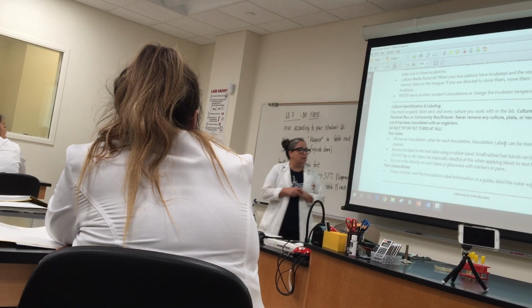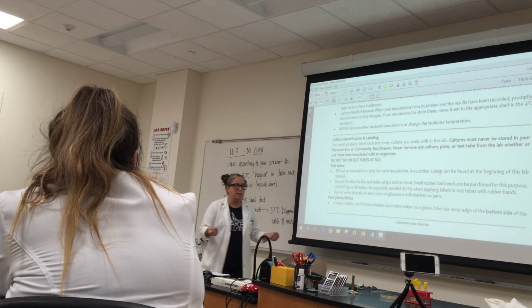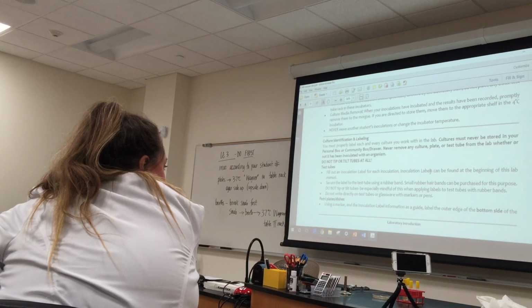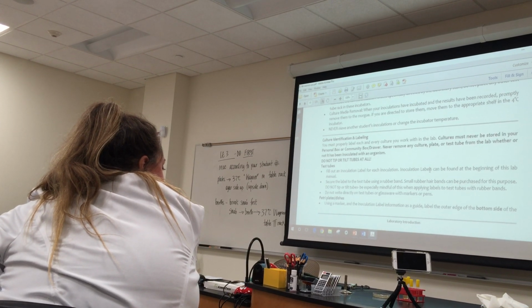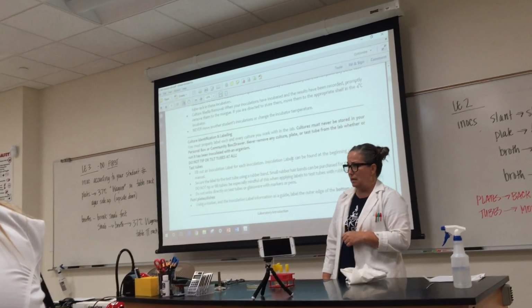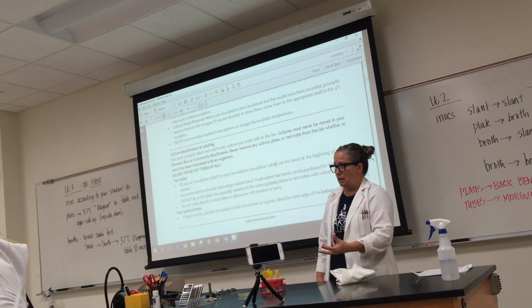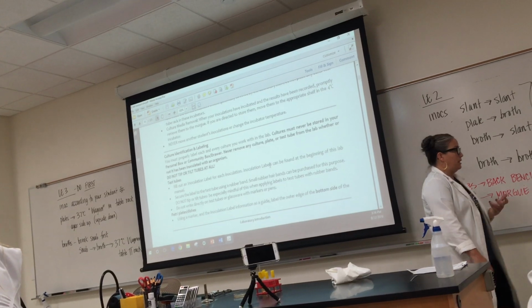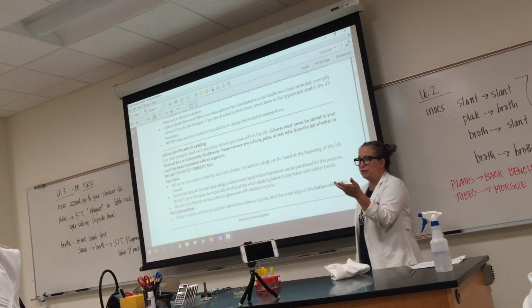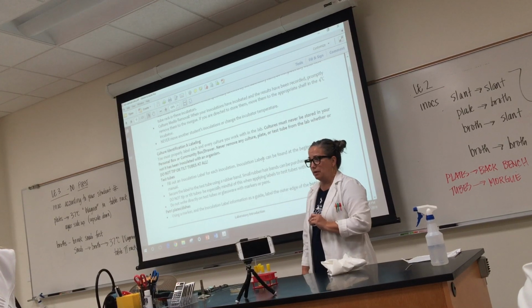It's very important that you always label cultures so that we know what's in the tubes, right? And it's important that you either completely fill out an inoculating label, or you put that same information on a Petri dish, right? So you don't just put your name and some random thing that nobody understands. You put your name, you put the date, you put the organism that's in there, and the media that it's in. So as a rule of thumb, when you're writing on a Petri dish, just think about these 4 things and make sure those 4 pieces of information get there. Now you can put your initials, that's totally fine, but you need to put your name so that we know that it belongs to you.